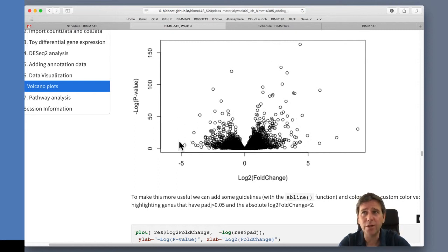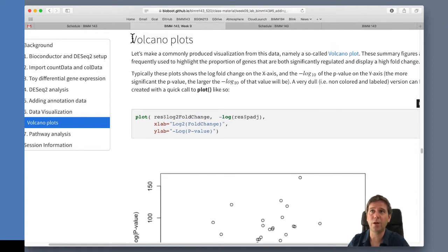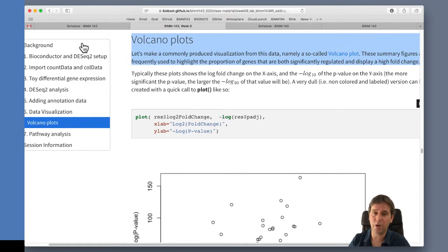And then we could just plot it. Let's actually plot it against p-value and see what that looks like, and that will motivate why we take this funny unit here. So I'm going to go back to RStudio and make one of these volcano plots. Take this text just to add some context to my R Markdown document.